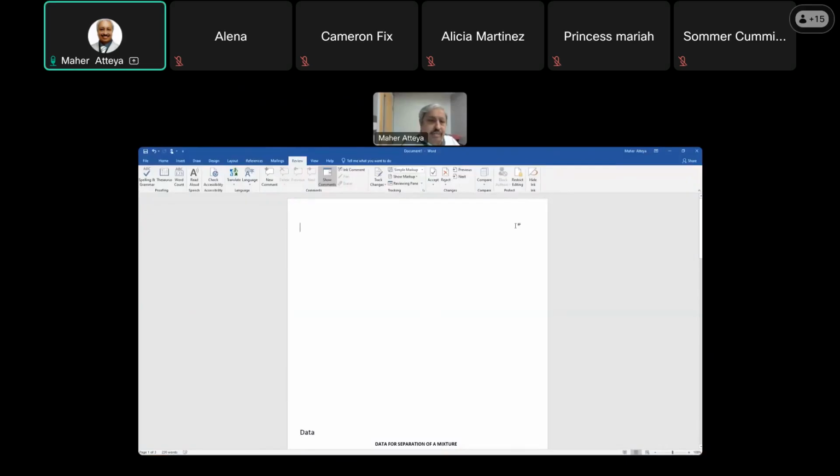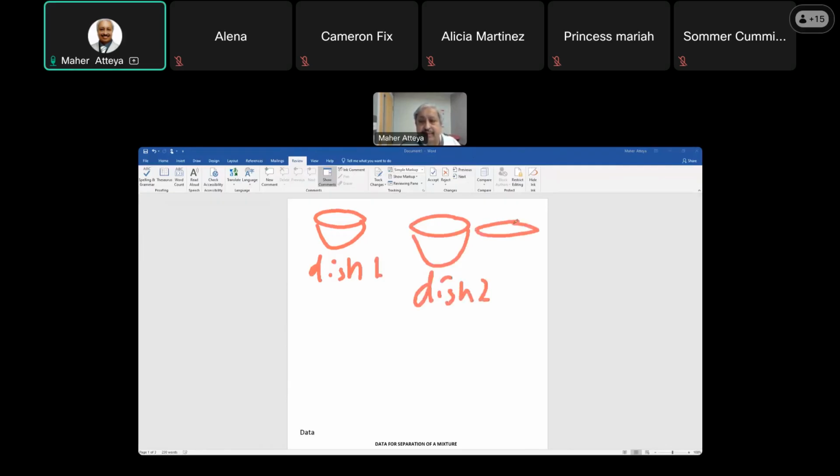So here it is. You'll have two. That's dish number 1. Dish 1. And then you have dish 2, with its watch glass.